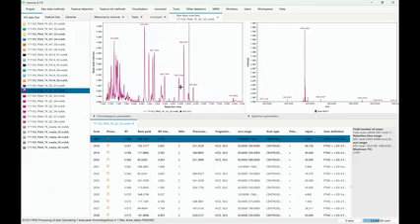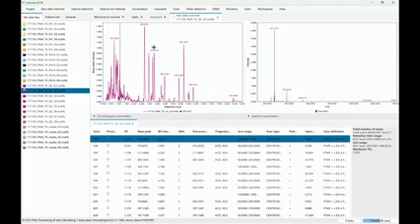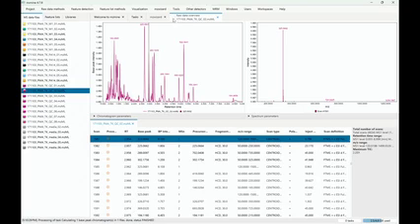I honestly think it's very important that people actually look at data at least once to make sure your analysis is actually running like you hope it is. It's quite tedious to do too much manually, and I really just do it quickly. But one thing is also sometimes you want to just compare the QCs by eye. So we can click on this little checkbox on the top, the raw data overview checkbox.